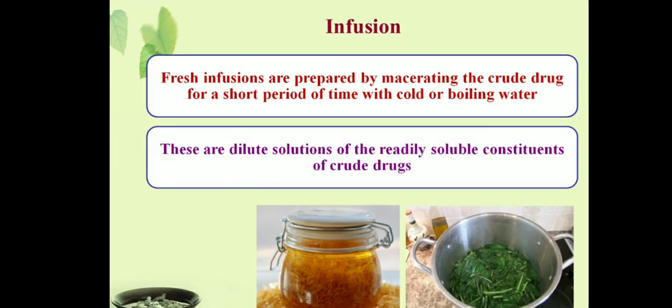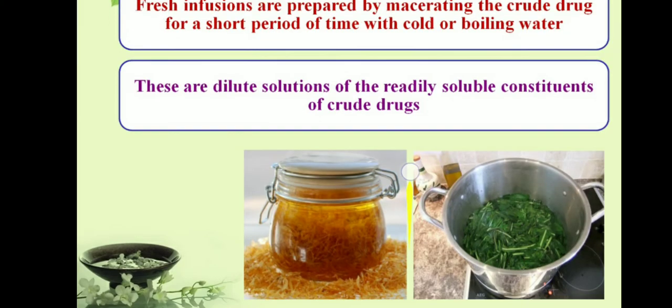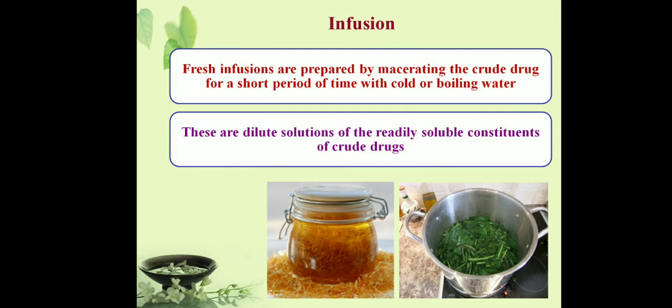This is another method, infusion. What is infusion? Fresh infusions are prepared by macerating the crude drug for a short period of time with cold or boiling water. You can see in this picture the infusion method. These are dilute solutions of the readily soluble constituents of the crude drug.